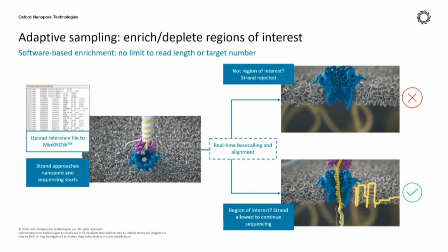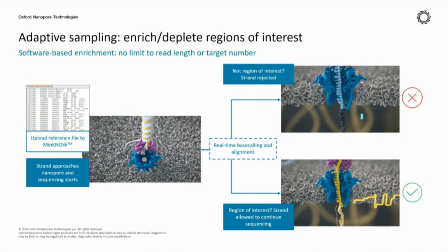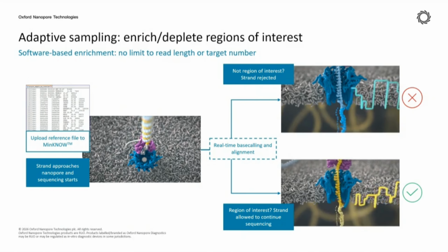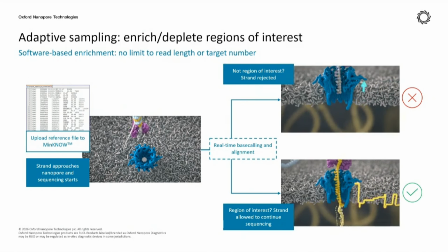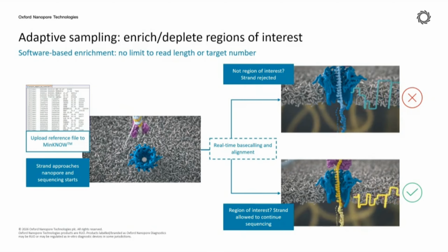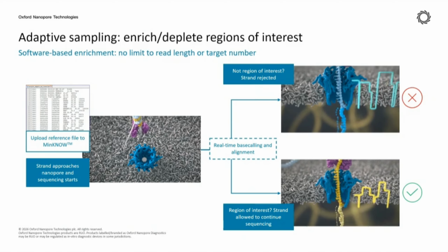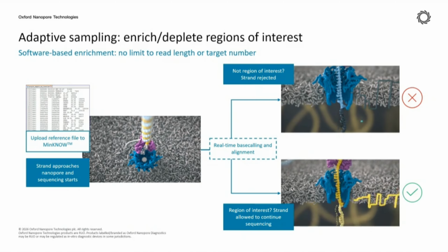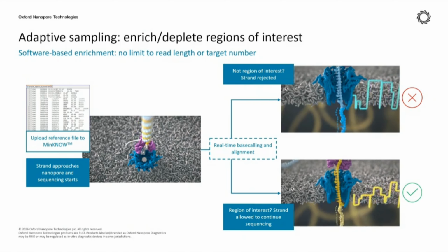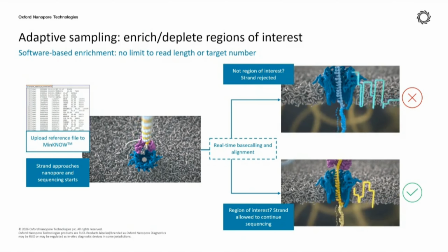So in the sequencing software, we can actually inform the software what our target regions or target genes are. So when the sequencing is being carried out, the sequencing software will check whether the ones being sequenced are the targets that we want to get from the sequencing. If it's sequencing the right genes at the moment, then the whole sequencing process will continue.